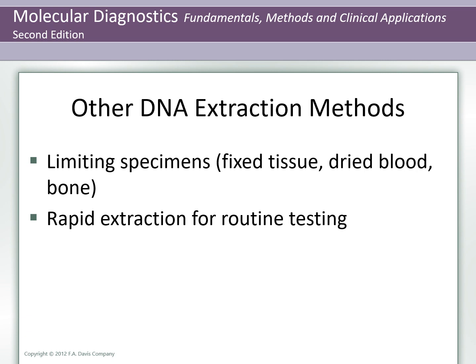The analysis of paraffin samples is frequently performed in the clinical laboratory. Fixed tissue is more conveniently accessed in the laboratory and may sometimes be the only source of patient material. Thin sections are usually used for analysis, although sectioning is not necessary with very small samples, such as needle biopsies.